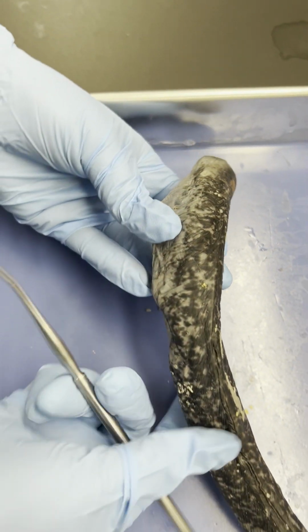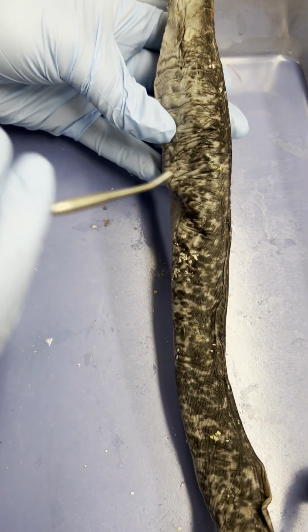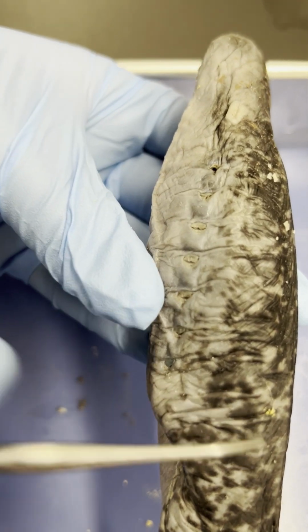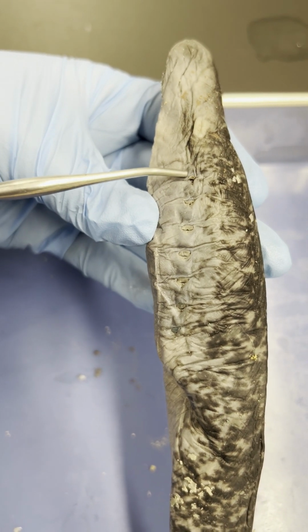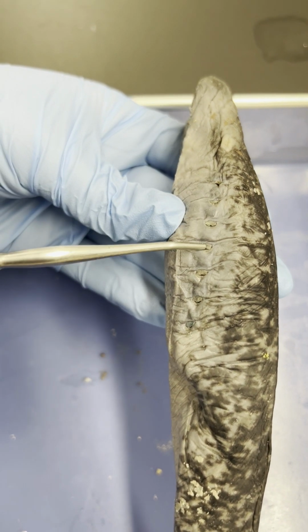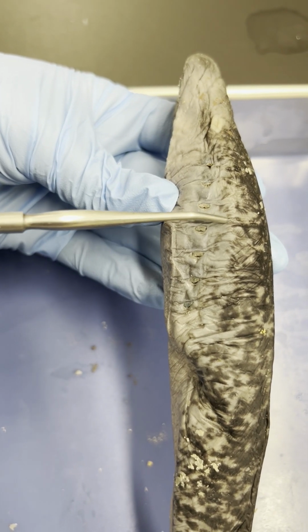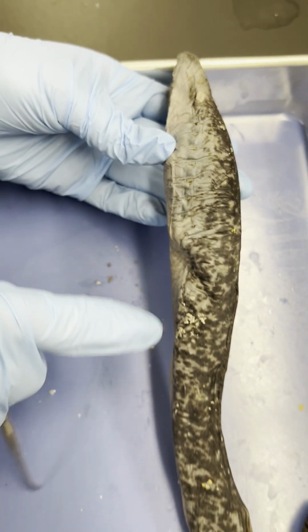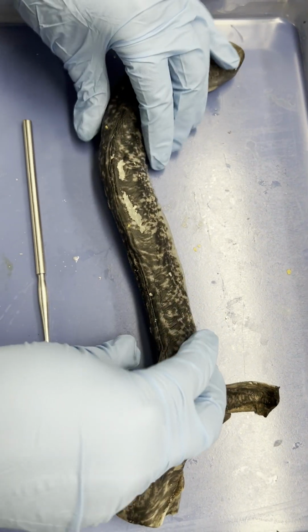Your second cross section is going to be between the 3rd and 4th gill slit, about mid-length along this branchial region. So we'll count our gill slits to make sure that we're going in between. So 1, 2, 3, 4, 5, 6, 7. So we'll go in between the 3rd and the 4th gill slit. And then the 3rd cross section is the part of the trunk with the liver and intestine.